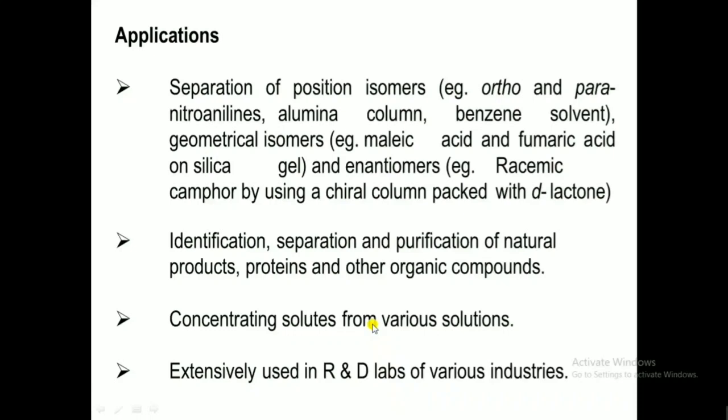So you can do adsorption column chromatography of the same mixture at different times and add the same components together. That means the concentration of the solutes can be increased, or you can concentrate the solutes from various solutions. Then the other application is that this is extensively used in research and development labs for various industries. Chromatographic separation is one of the most important research and development techniques in the chemical industry. So these are the applications of liquid solid adsorption column chromatography.